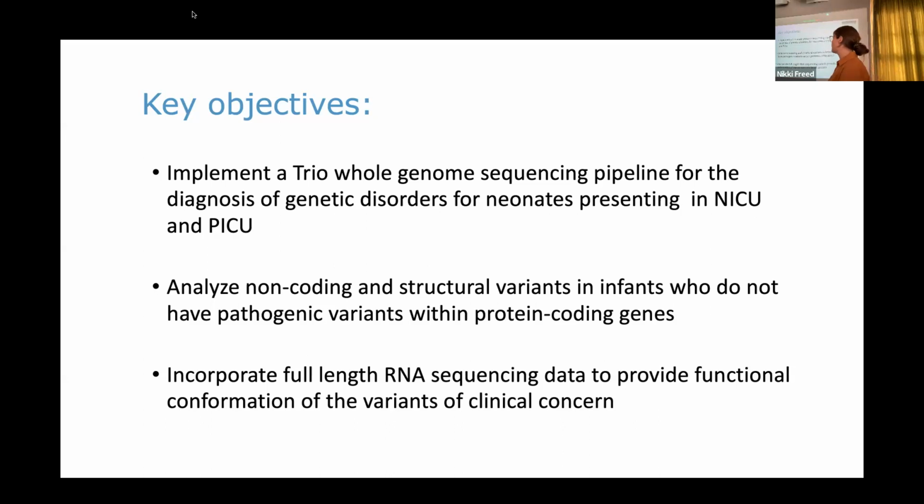And we'll also be incorporating full-length RNA transcript sequencing. That can be really useful, and we're hoping to be able to see the splicing patterns that are produced from any variants that are of clinical concern.